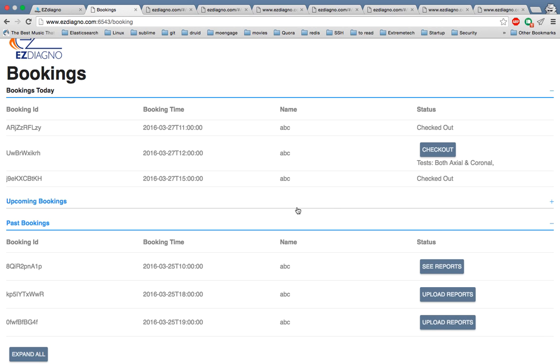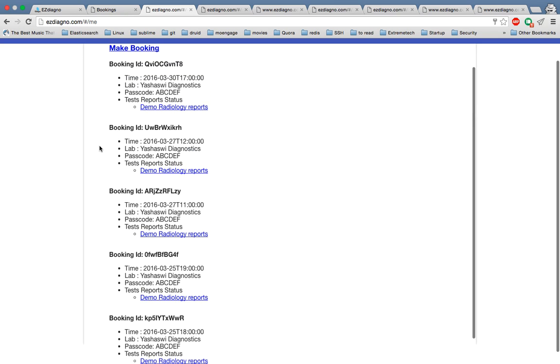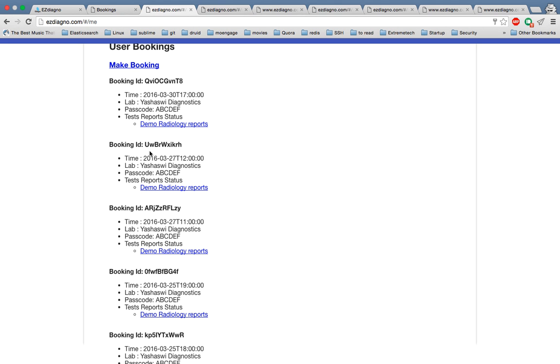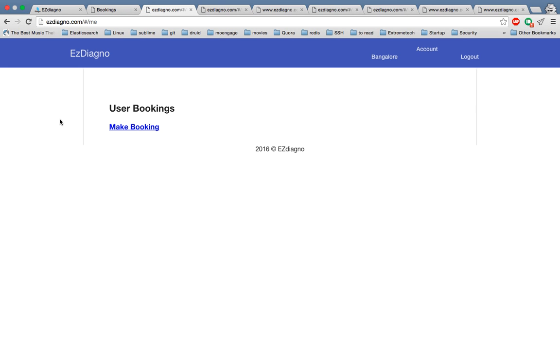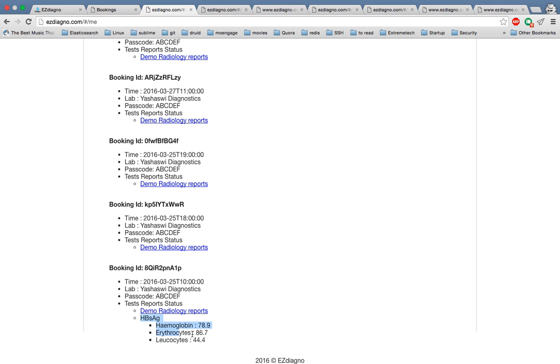As soon as the reports are uploaded, currently we updated the reports for one booking and there's nothing there for the other. When we update it, the corresponding report for that test, HBsAg, is present.